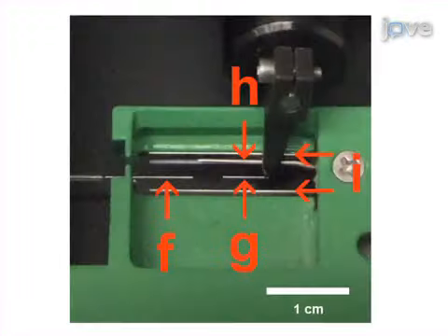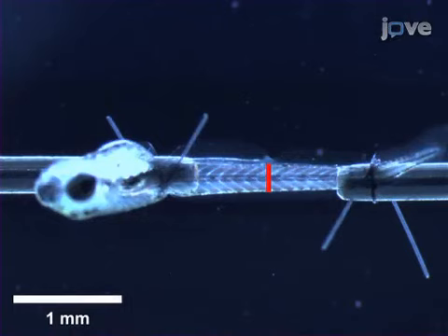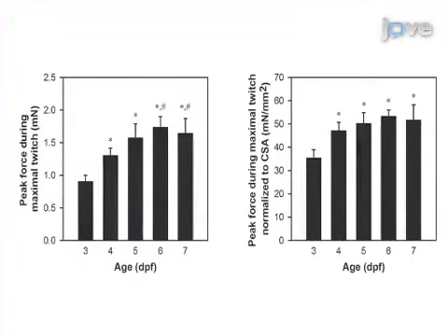Next, the anesthetized larvae is positioned inside the experimental chamber. Once in place, the force is recorded during a maximal twitch contraction. The final step is to measure the dimensions of the trunk musculature so that peak force can be normalized to muscle cross-sectional area. Ultimately, measuring force generation during contraction is used to show changes in muscle function and overall muscle health.